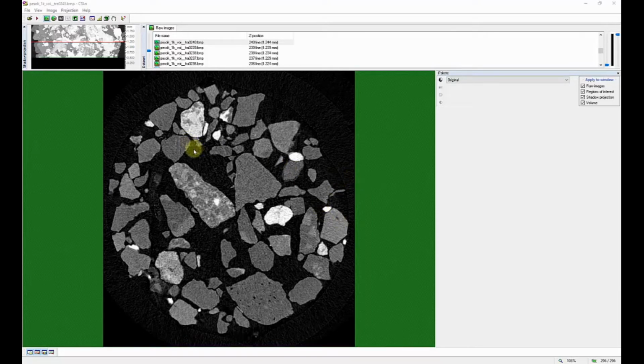So we can see we still have the same noisy, fast scan of some SAN data. And we see the noise present both as the white specks on the outside of the image, as well as some of the heterogeneity in the composition of the granules themselves, as we would expect them to be a little bit more homogeneous than that.